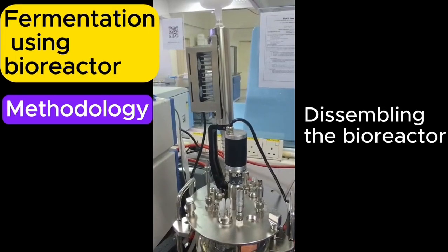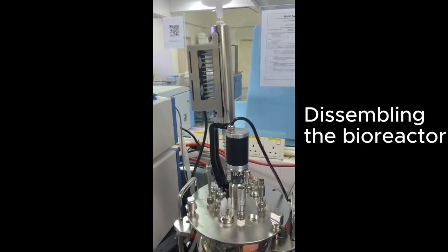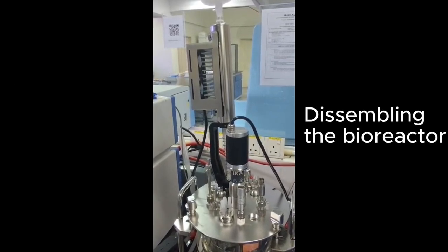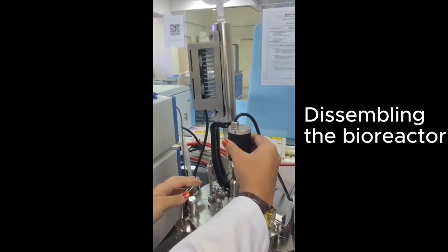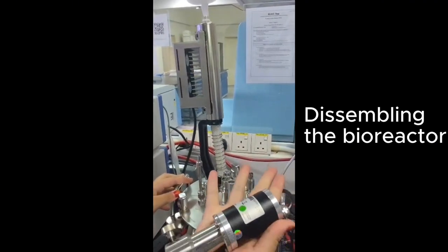To conduct the fermentation using the bioreactor, we shall disassemble the bioreactor first. To disassemble the bioreactor, we must first remove the motor driver and the exhaust. After that, open the clamping to take out the bioreactor to put in the media.